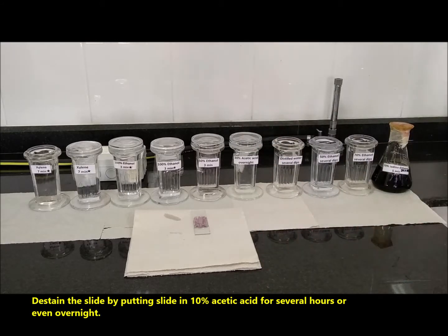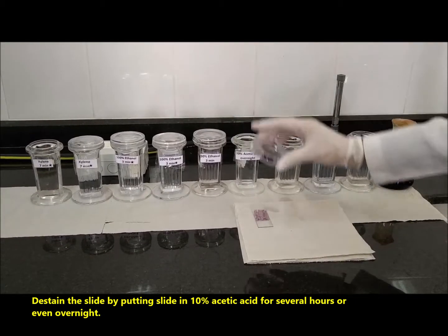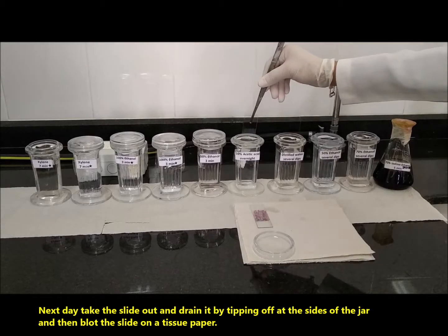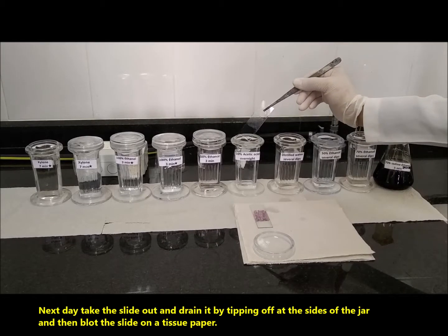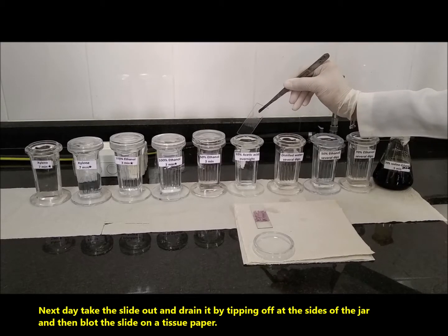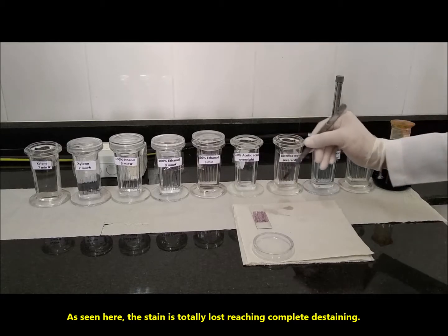De-stain the slide by putting it in 10% acetic acid for several hours, or even overnight. Next day, take the slide out and drain it by tipping off at the sides of the jar, and then blot the slide on a tissue paper. As seen here, the stain is totally lost, reaching complete de-staining.